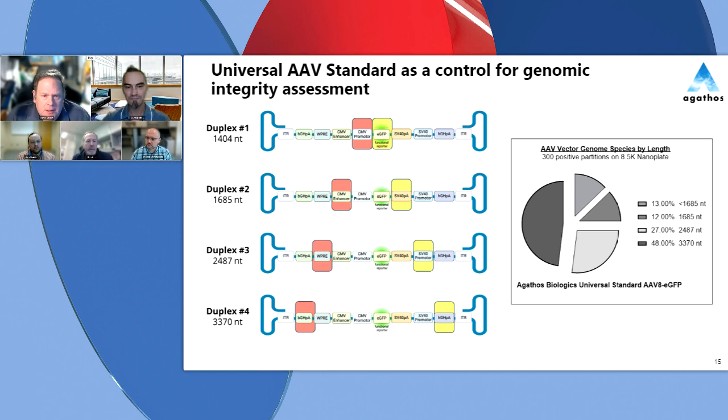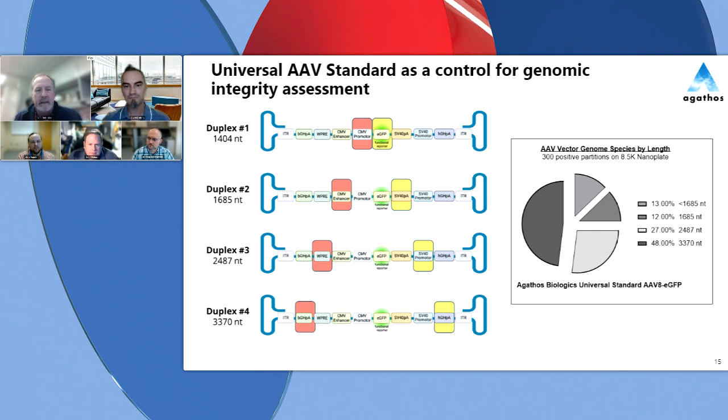Well, when Hong and my group presented this data within the company, it was pointed out at the end that the R&D group that was running a potency assay on this same site, the same construct, actually saw a very similar effect in potency. Based on what we were reporting, around maybe 40% full integration, or essentially fully integrated genome, they anecdotally said this explains a lot of the potency data around this construct.